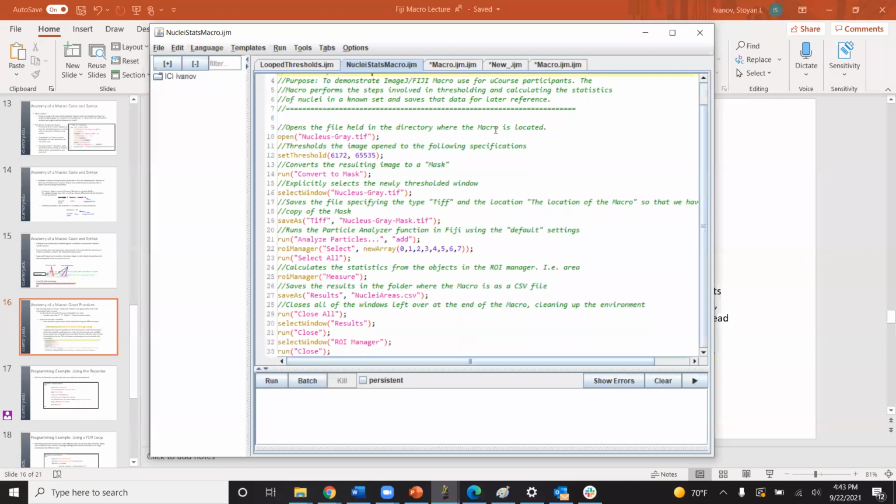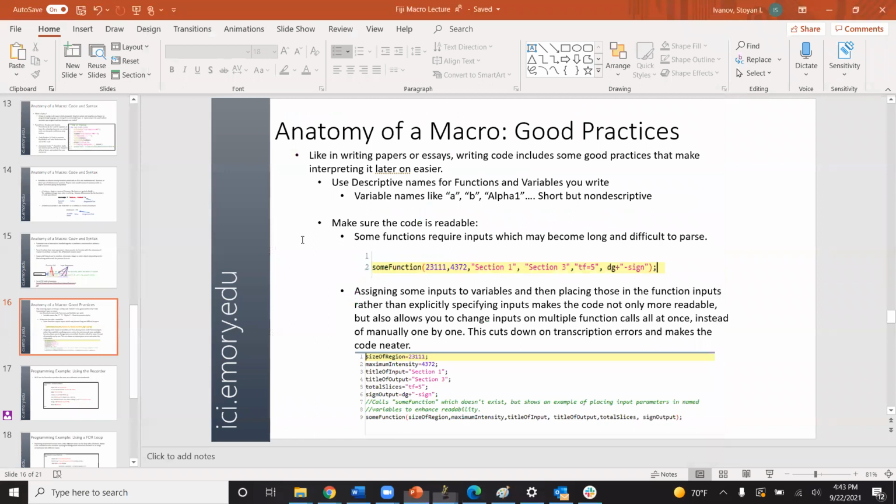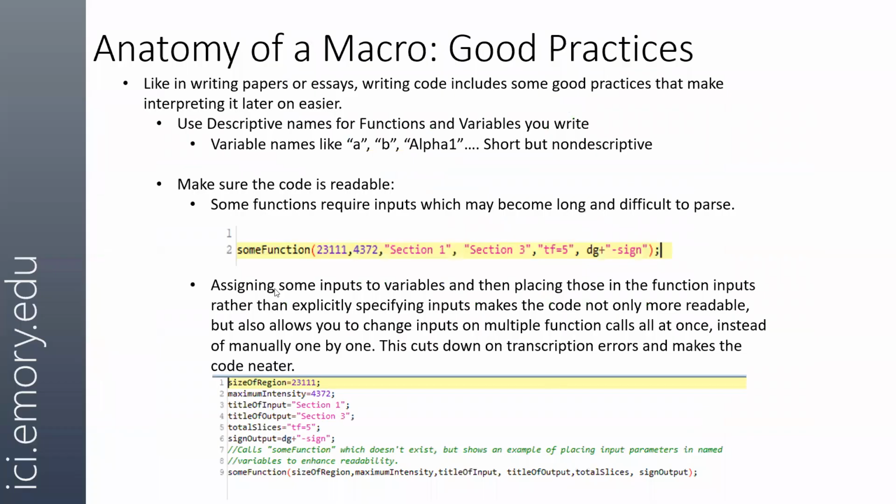And then for almost every action taken, I have a comment that describes what it's doing and why it's doing it. And again, it's a good habit to get into. I know I've come back to code that's been a few months old, and sometimes I can't make heads or tails of it. Definitely those times I wish I had done the commenting ahead of time.